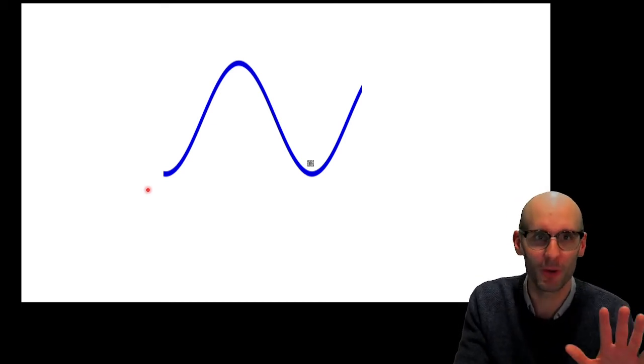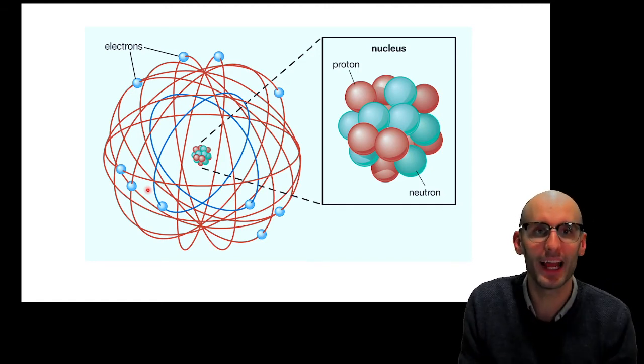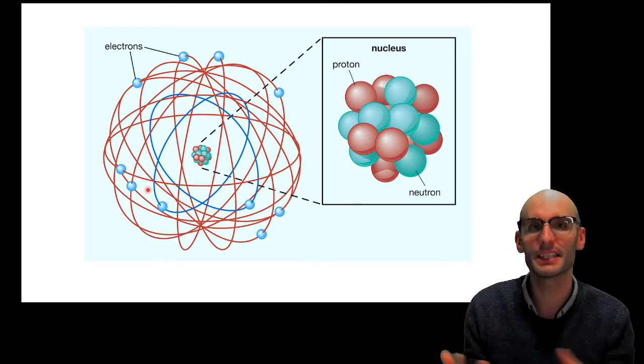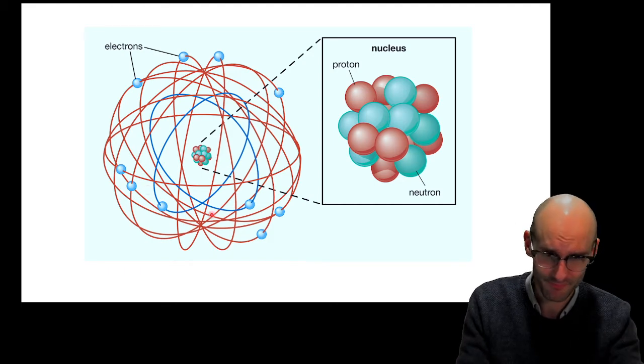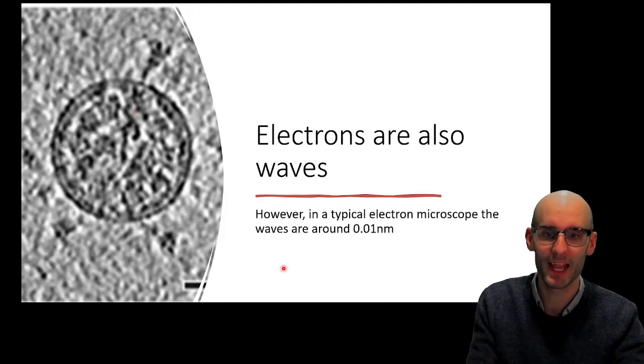So this is the problem. So where did we go? Well, they went to electrons. Now, we're all familiar with electrons as the source of electricity, but also those circulating particles around a nucleus. So they are negatively charged particles that travel around a nucleus.